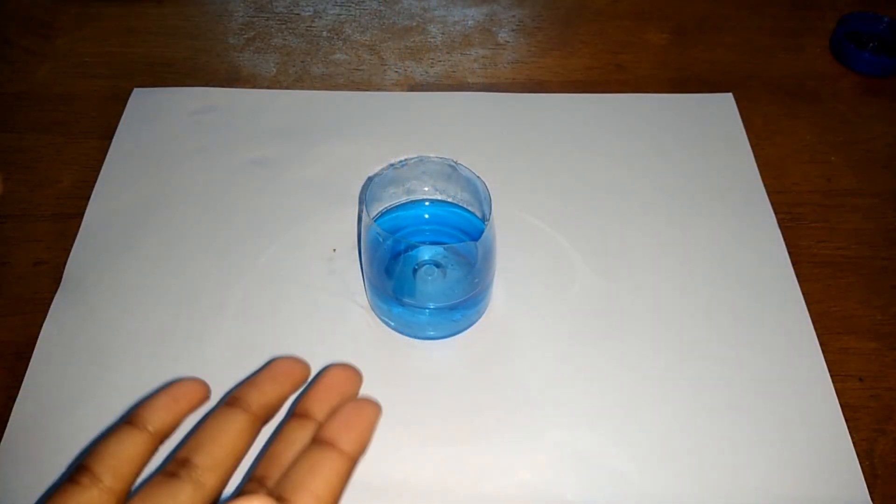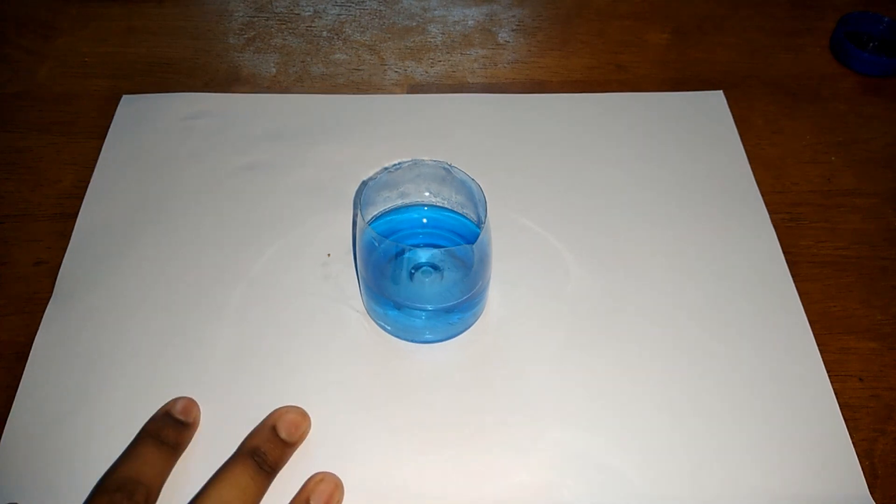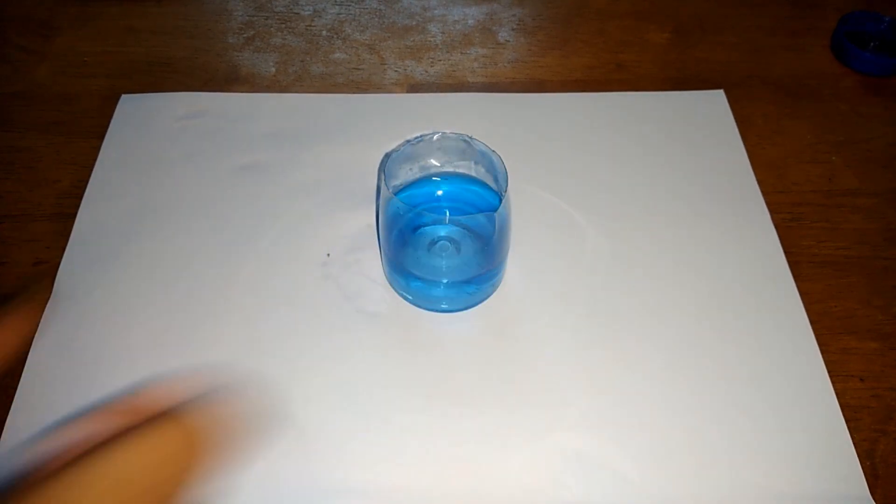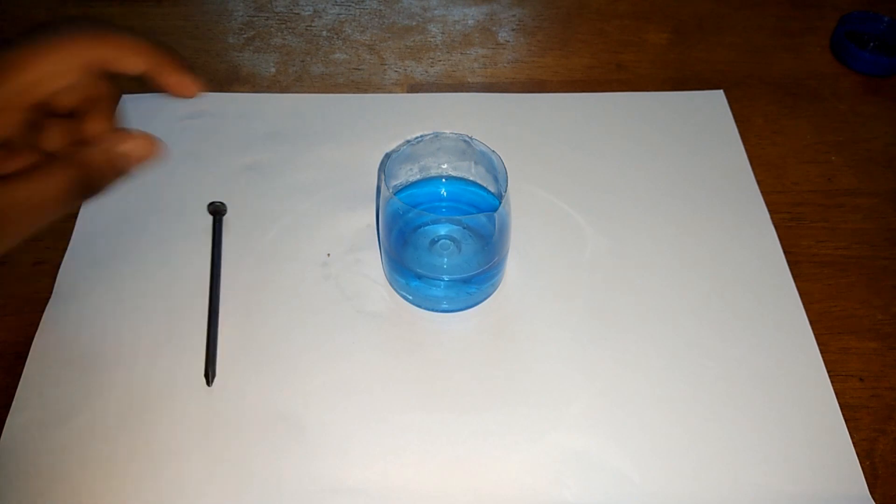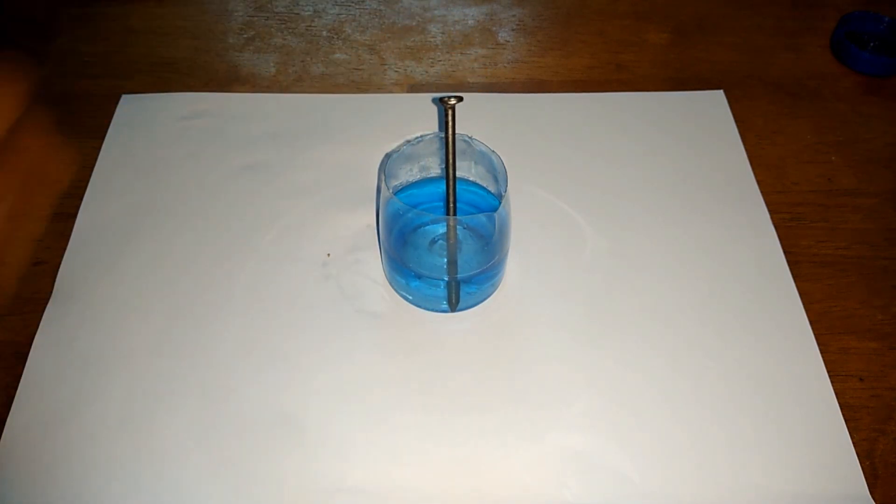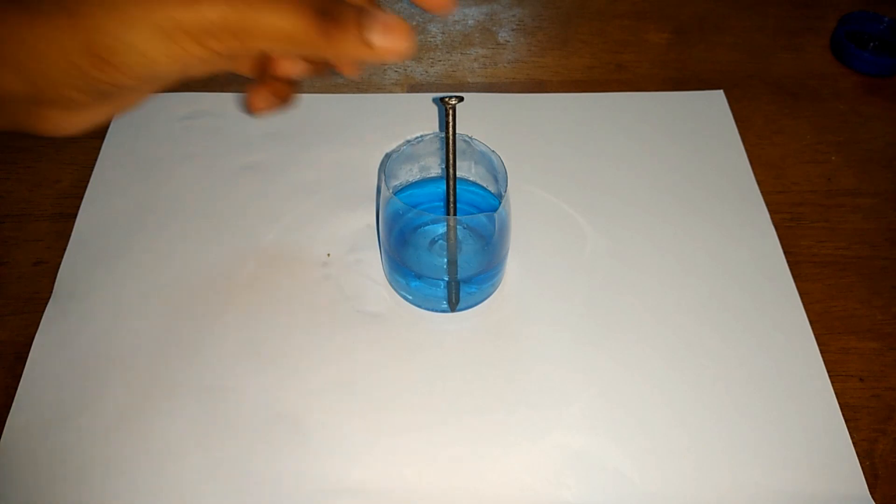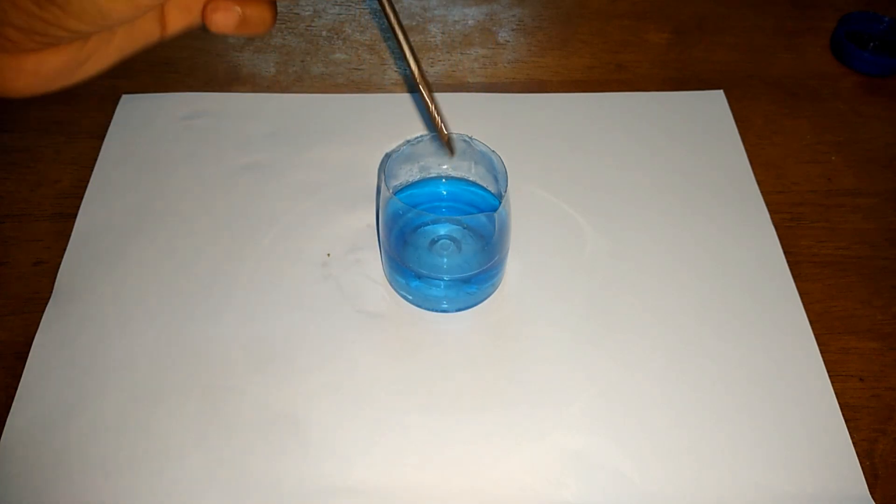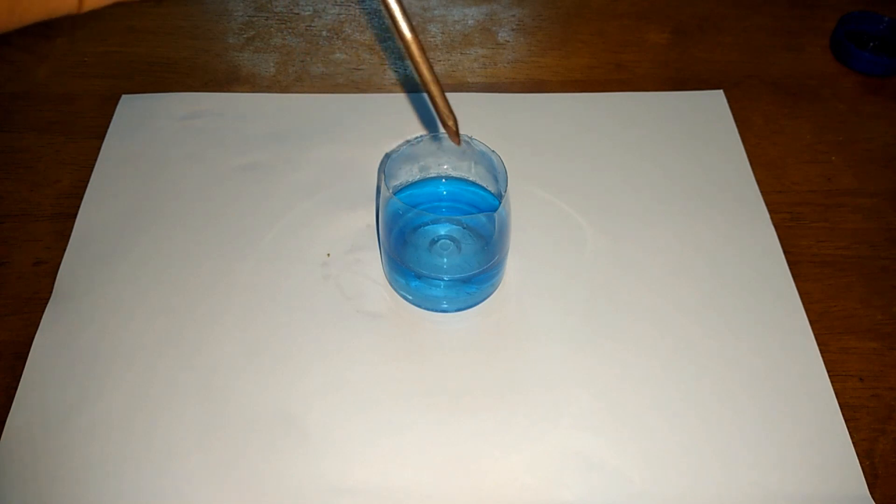So now that the copper sulphate has dissolved completely, I have added a white paper here to show you the proper blue colour. And now, I am going to add my iron nail. And if I take it out, you can see that there is already a slight brown deposition here.